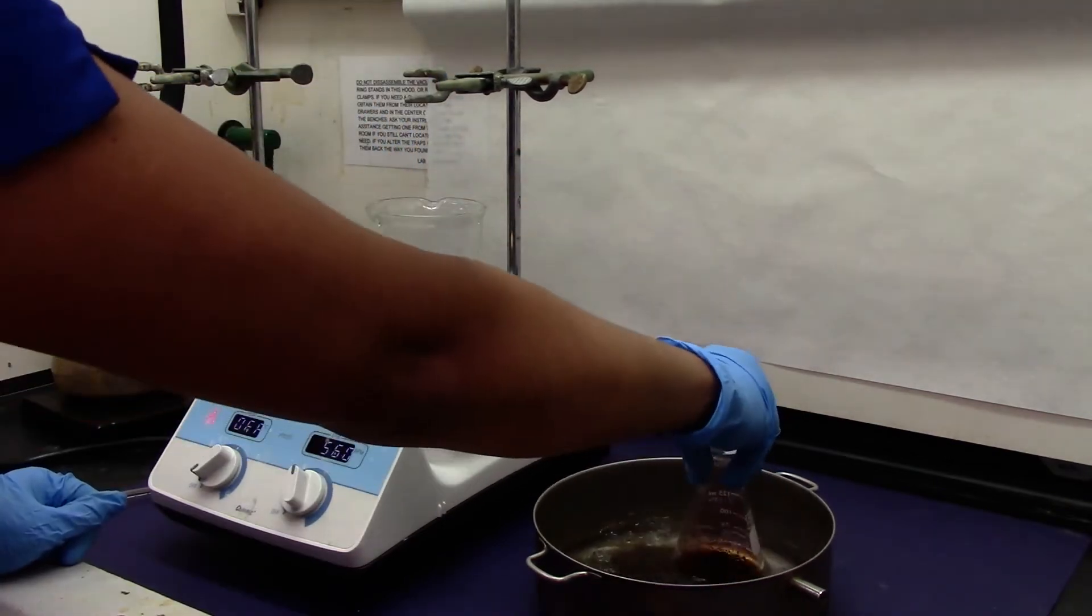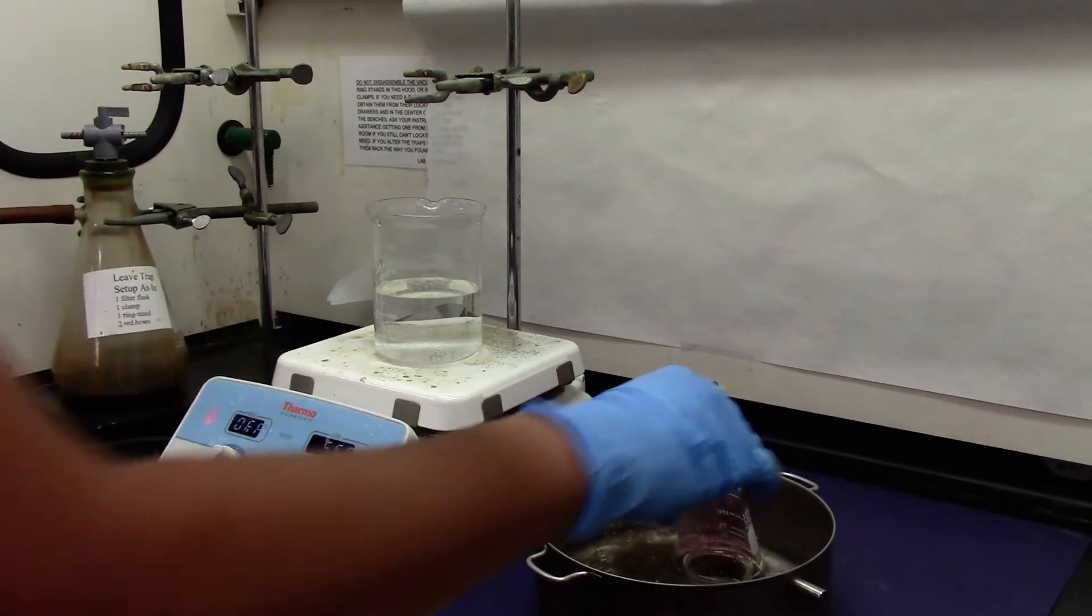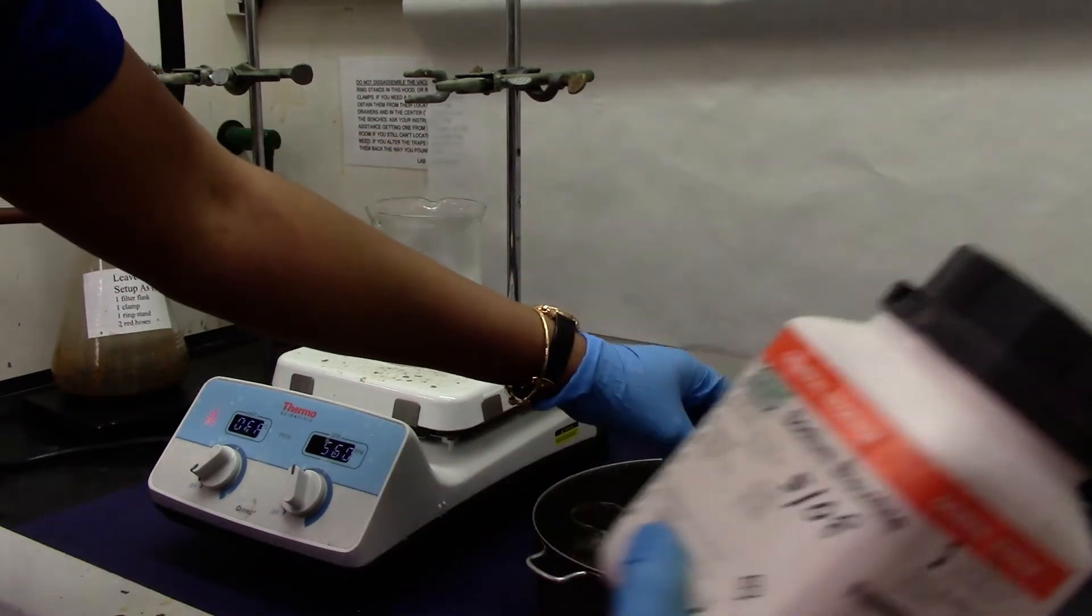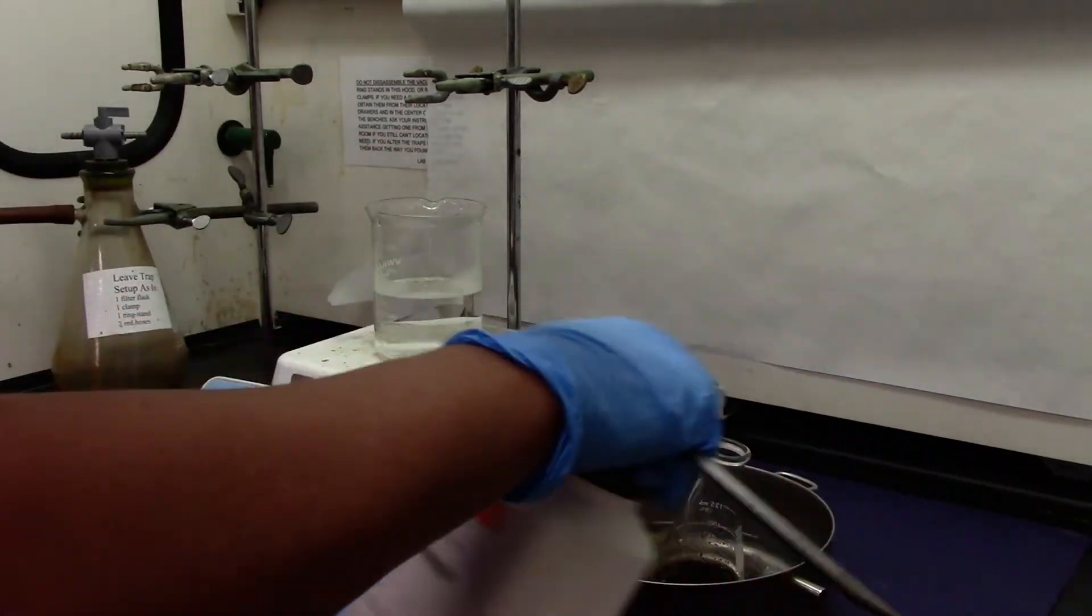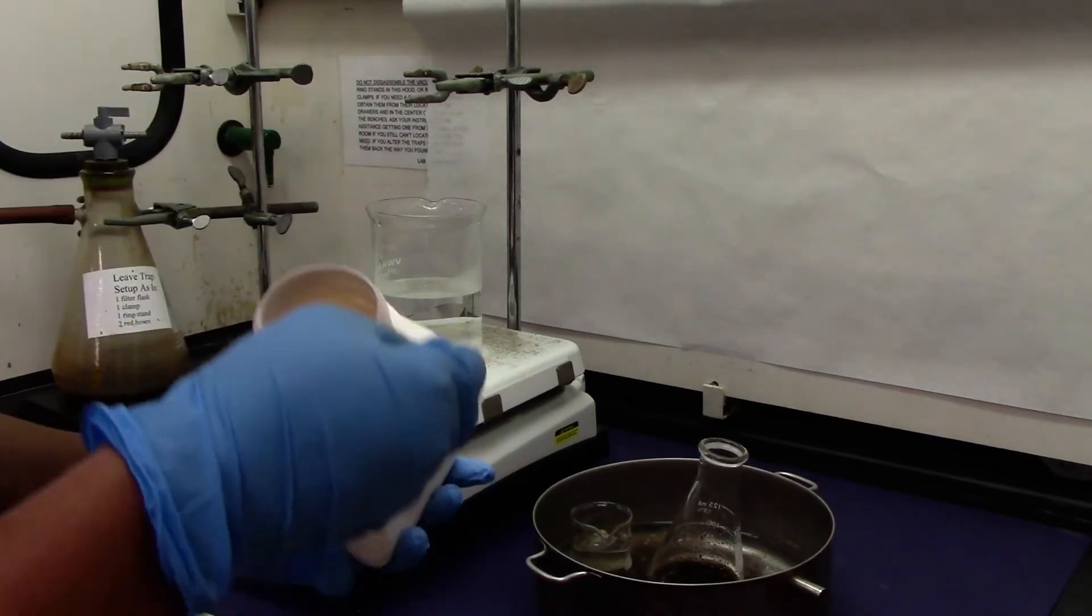We will place it in the ice bath. We will also put some DI water to cool down for the filtration. To this cold solution I'm going to add a pinch of sodium bisulfite to decolorize the iodine.